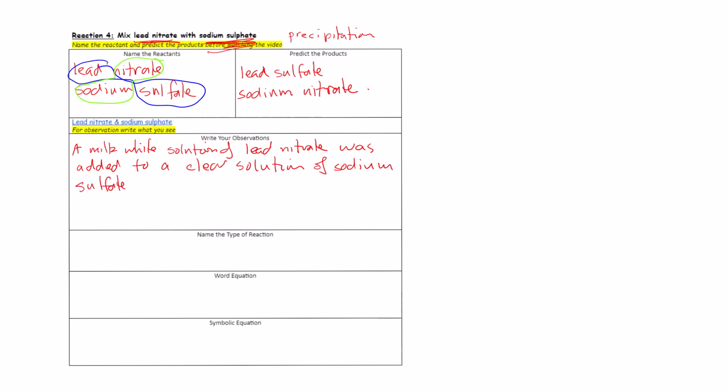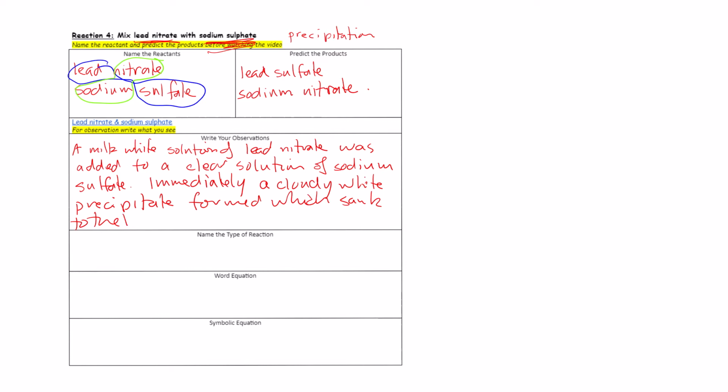Immediately, what happened? Immediately a cloudy white precipitate formed, which sank to the bottom of the solution, leaving a clear solution above.